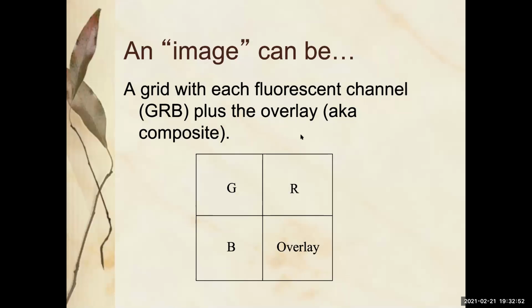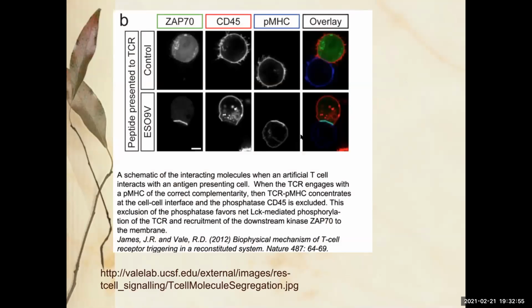And what are they? Well, we're going to skip ahead one slide so I can tell you about them, because this semester is a digital, or online, semester. We're doing things in a different order. At this point in the class, we usually go specimen prep, image acquisition, and then post-image acquisition processing, step 3, which is where we are. We're actually starting this semester with image processing, and then you're going to get to do specimen prep and also image acquisition when you get the scopes at home.